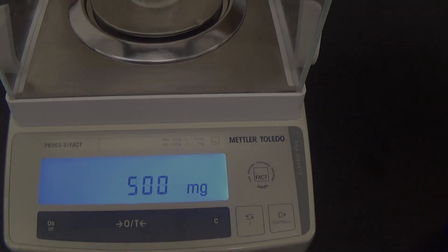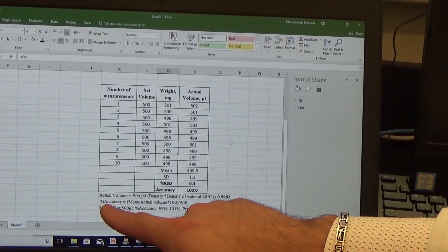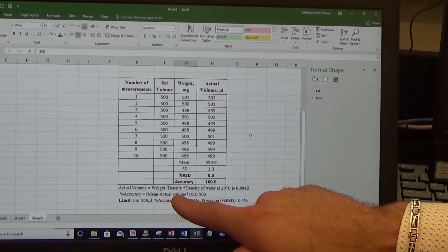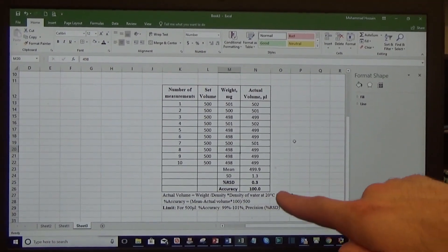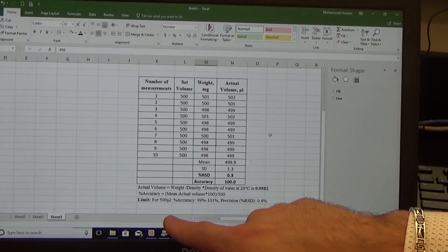We have the micropipette set for 500 microliters. Using the density of water, we calculated the actual volume, then calculated the accuracy and precision using Microsoft Excel. For this specific micropipette use, this is the acceptance limit.